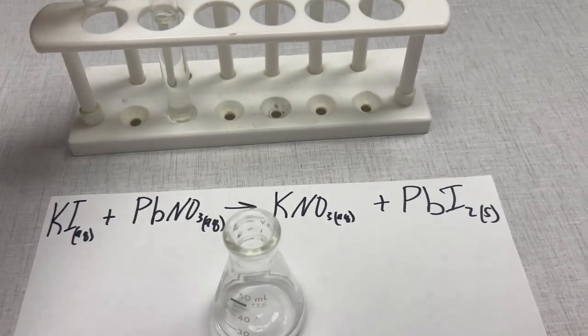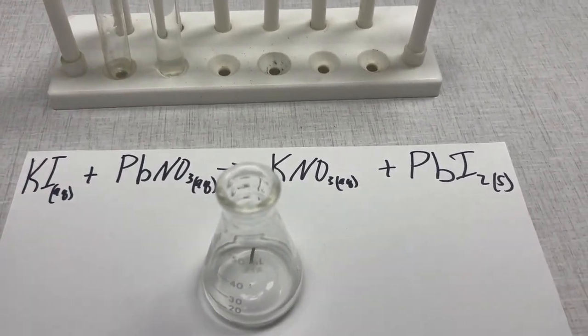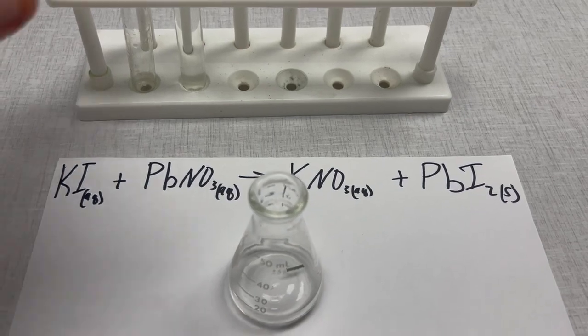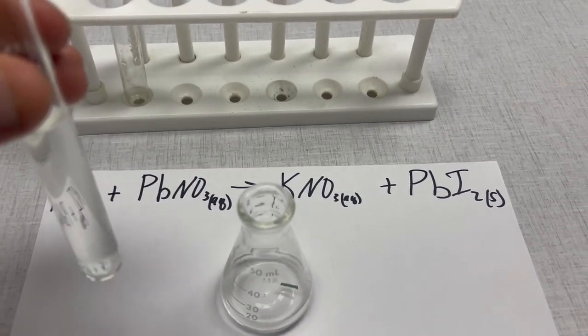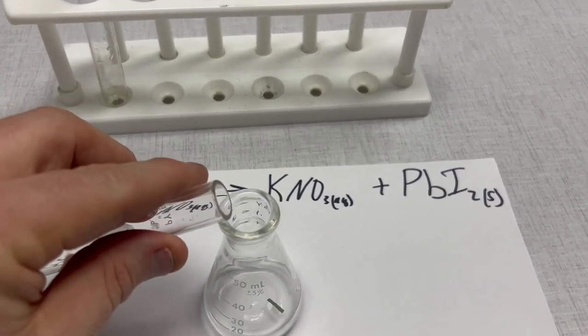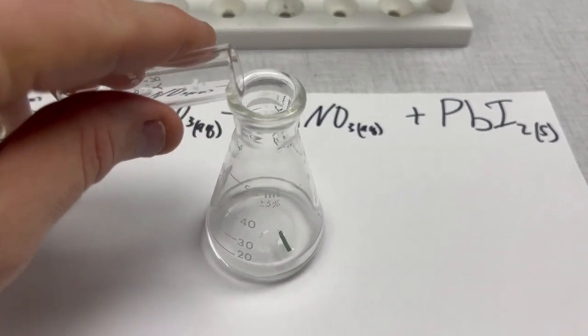You can ignore the green little floating thing there, that's actually a thing off of my chemistry set that somehow got in there. And then now we're going to add the lead nitrate and we'll see what happens inside of here.